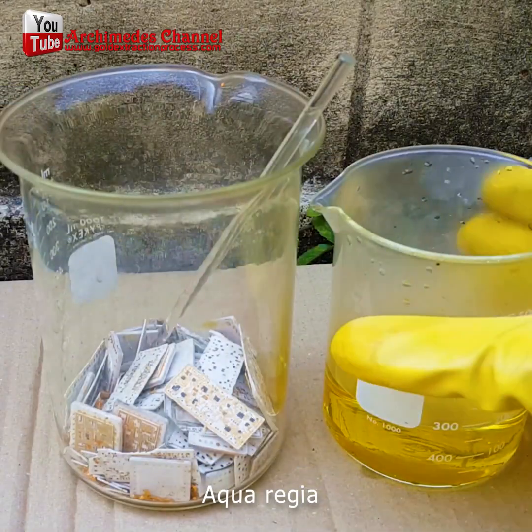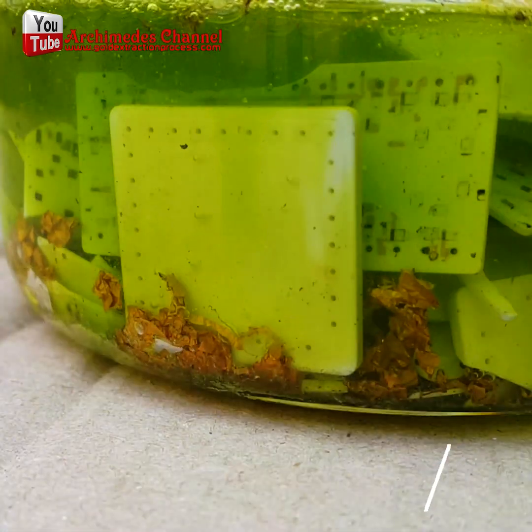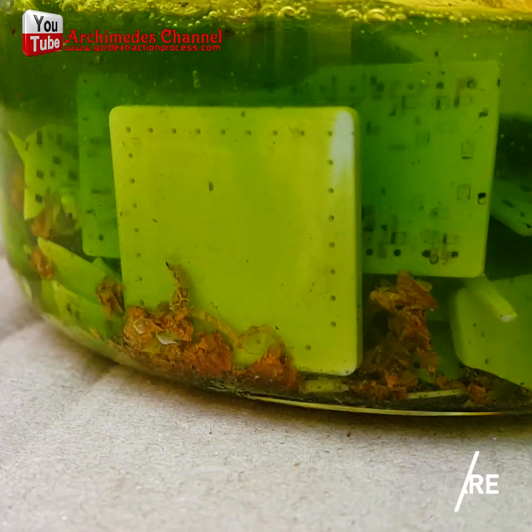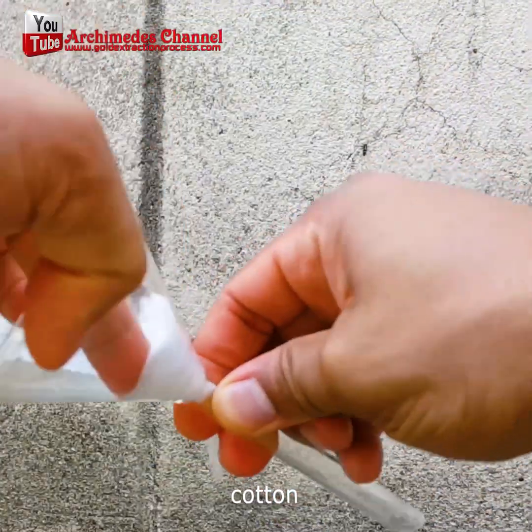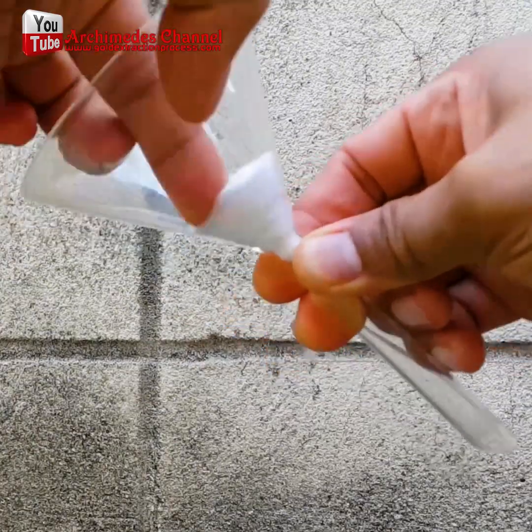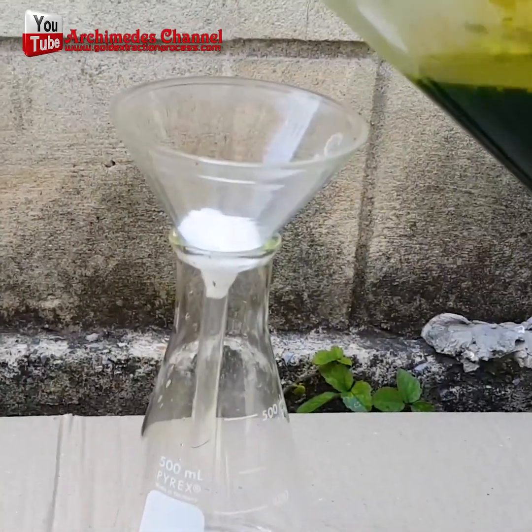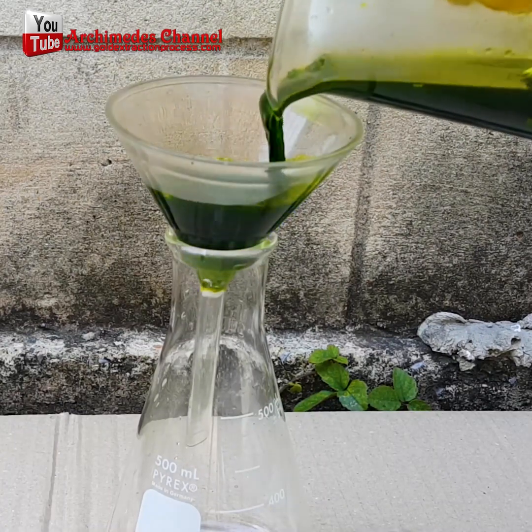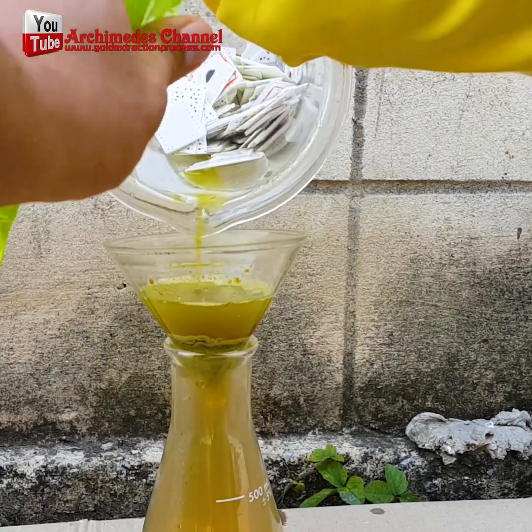So with all those difficult pieces piled up, it's time to put that mixture together. The aqua regia is ready and in it goes to be mixed up. Just watch what happens — that plastic breaks down. Some nasty fumes come out, so work in a well-ventilated area and wear a mask if you're trying this one out. And it's then filtered, those chips now looking stripped.